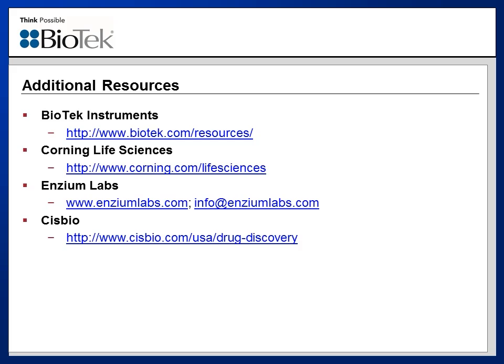And then the next question is, how deep can the microscope image inside of the tumor spheroid? That's a good question, and as I mentioned previously, this is a wide field type of microscopy. So the actual amount of penetration of the light into the tumoroid structure is not going to be as complete as other types of microscopy.